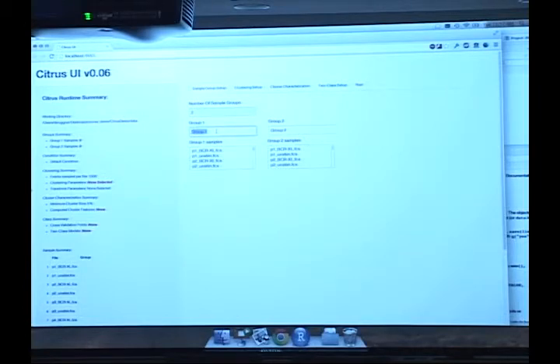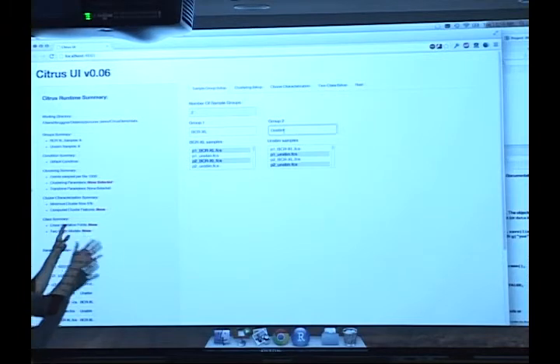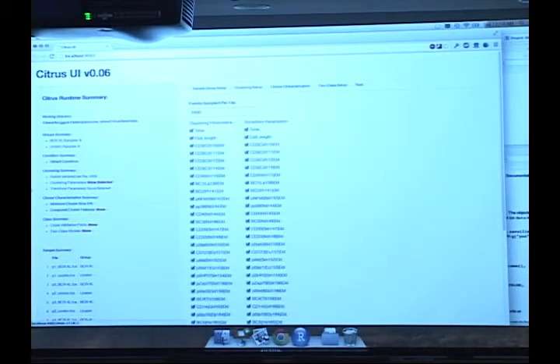You can say, one of my groups is BCR stimulated. And it will go ahead and select all the samples that have BCR in the title. The other group is unstimulated. Unstim. It will select those guys. So this is where we're sort of framing our question of interest, saying which samples belong to which groups based on your prior biological hypotheses.